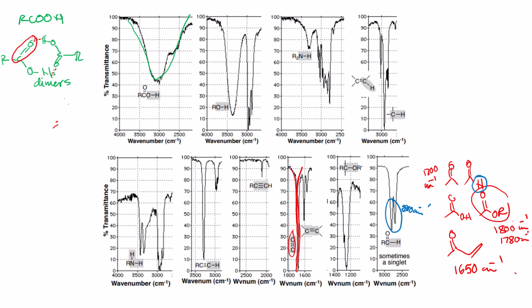Now let's go to the following shape here that I have. This one is an alcohol band. So alcohols tend to have a somewhat broad shape, but not as much as the carboxylic acid. And again, the reason for that is that alcohols, when they are in relatively concentrated solution, will form hydrogen bonds. And hydrogen bonds always broaden the band.